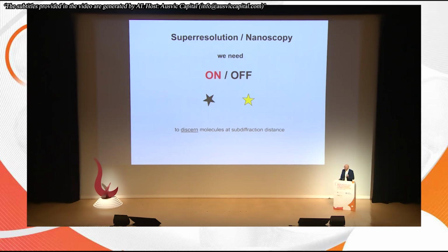And this is the key physical enabling element behind STED, PALM, STORM, PAINT, SOFI, all the super-resolution methods that have been developed until now. The role of the STED beam is to shut off fluorescence. PALM, you need a photoactivation. STORM is the same thing. PAINT, you need a binding or unbinding process.